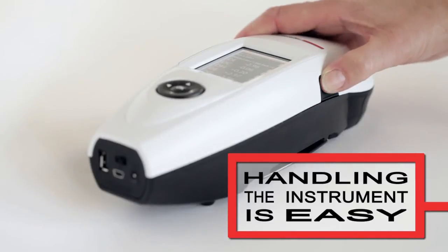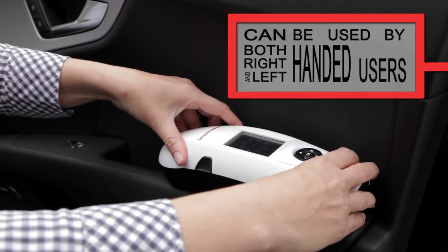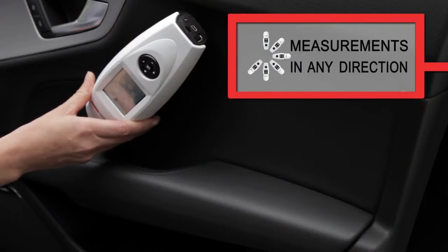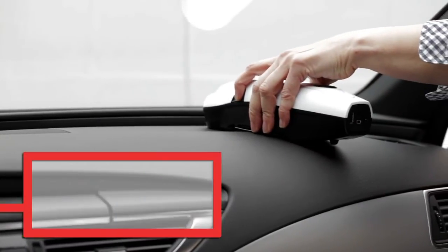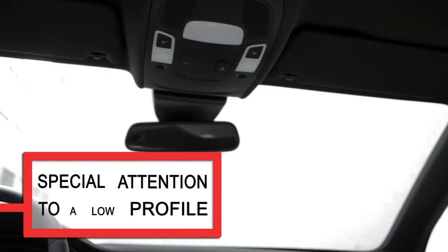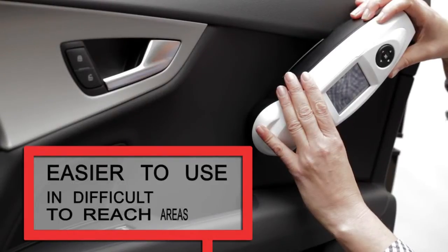Handling the instrument is easy due to its ergonomic design. It can be used by both right- and left-handed users and can take measurements in any direction. In the design of the 45G, the development team has paid special attention to a low profile, which has been a priority to make it easier to use the instrument in difficult-to-reach areas.